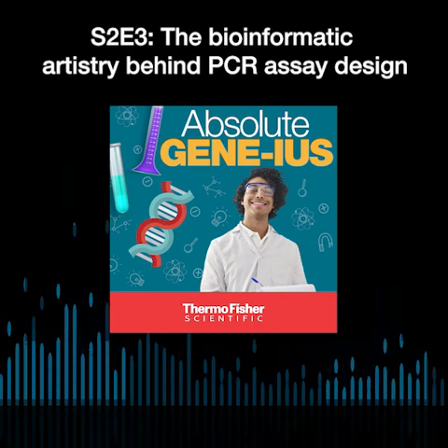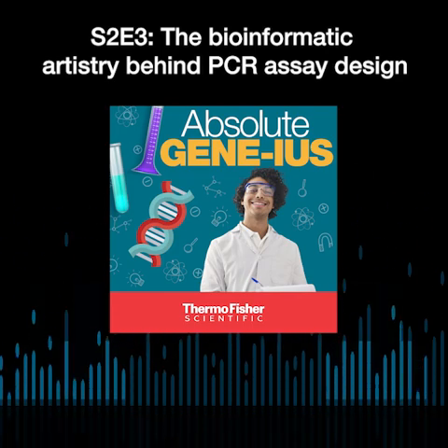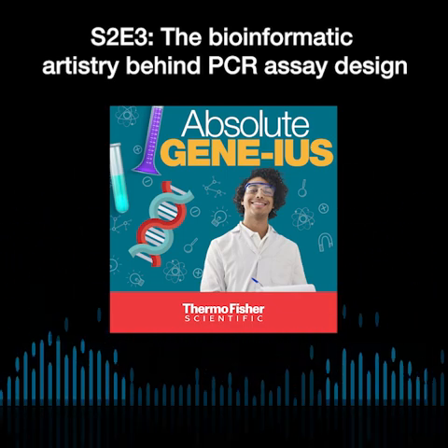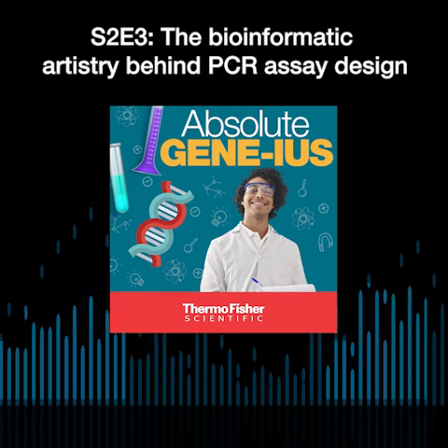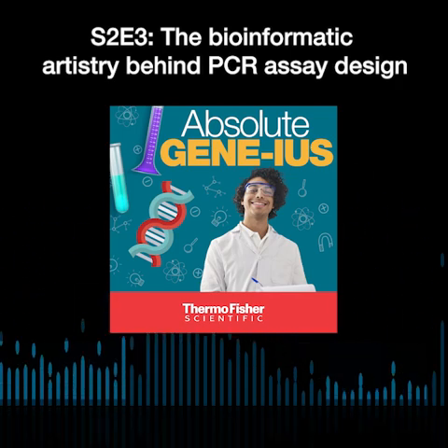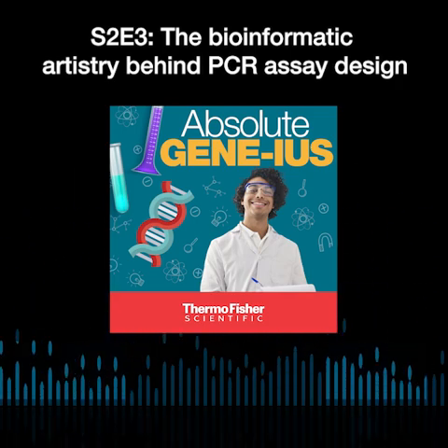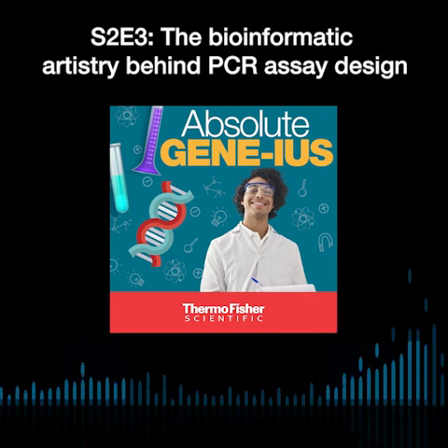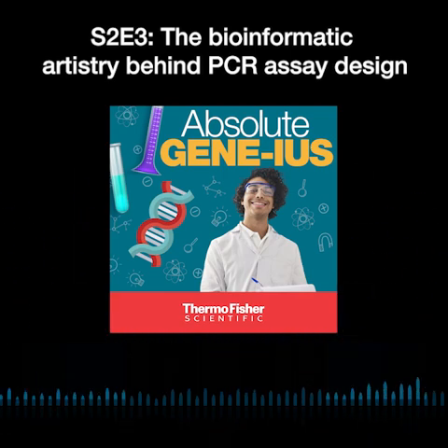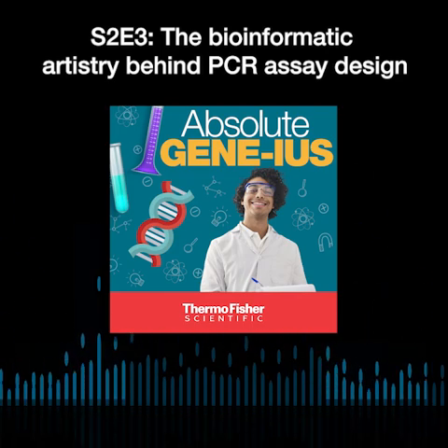How does bioinformatics play in? What kind of bioinformatics are you running as you design assays? Yeah, so the design for the assay does sometimes warrant a change in our experimental setup. That's why it's very important that when we are developing an assay, there are two parts to the assay development. One is the wet lab, the R&D, a molecular biologist with whom you really work closely, and the bioinformatician.